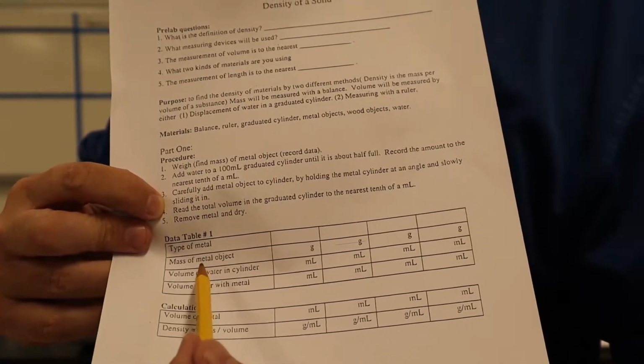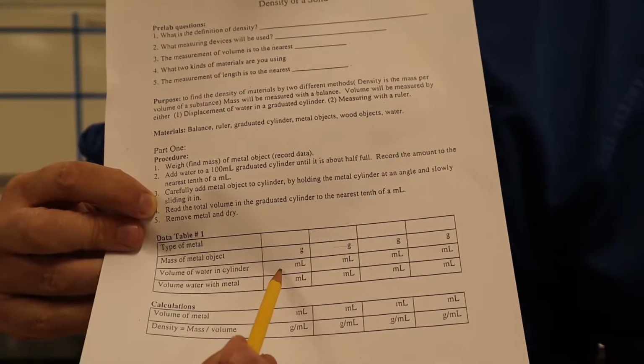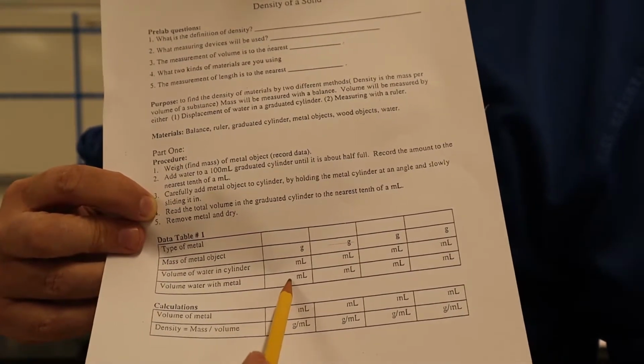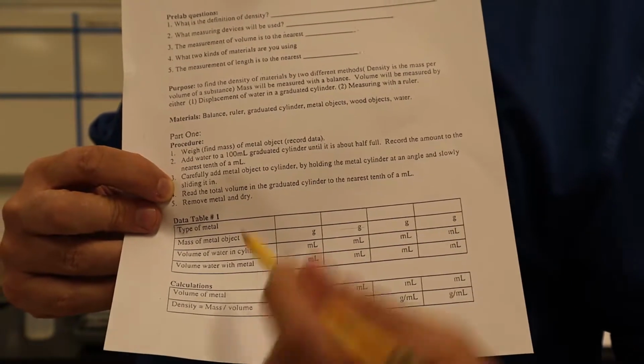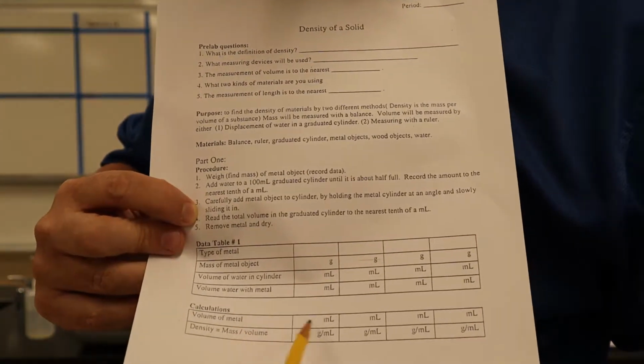Most students have that, right? So we're going to write down the volume of the water in a graduated cylinder, and then put the metal in it, and then write the new volume. And then the difference in water levels, the amount that the water rises, is the volume of the metal, right?